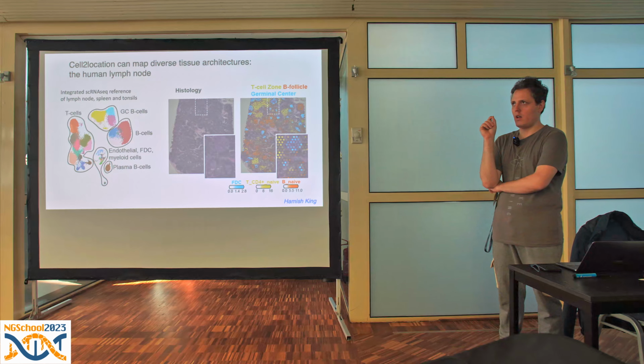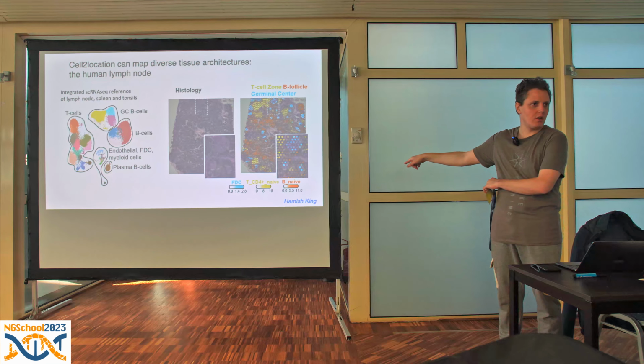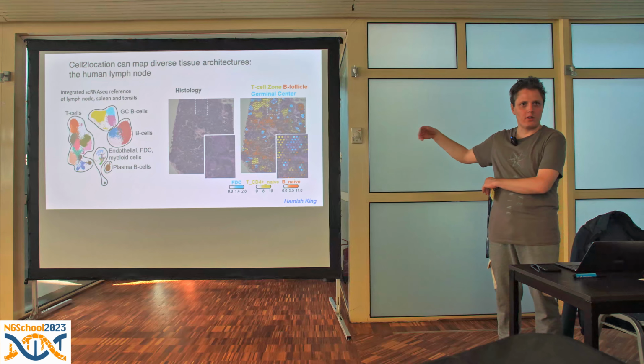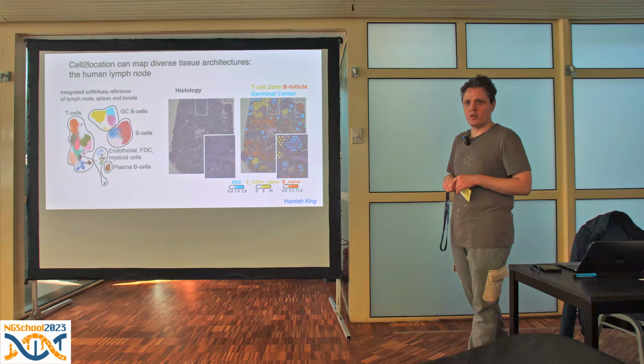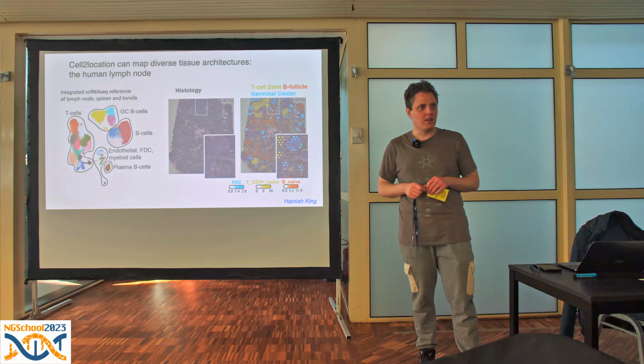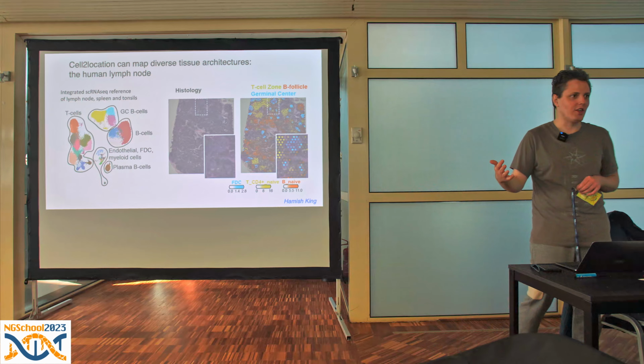In this case, we used the exact reference published by Hamish because it worked for the applications that we wanted to do. I find that in many cases, when you take someone else's atlas, you don't really agree with their cell annotations.